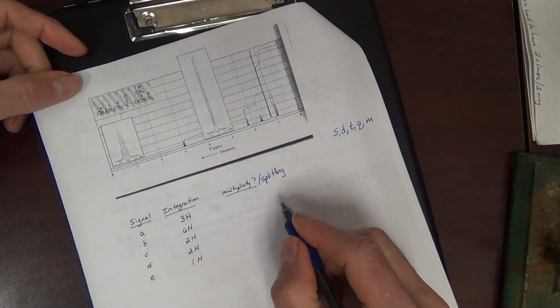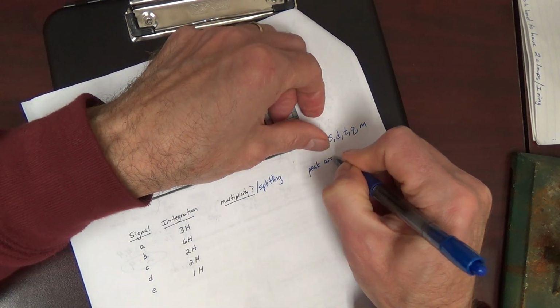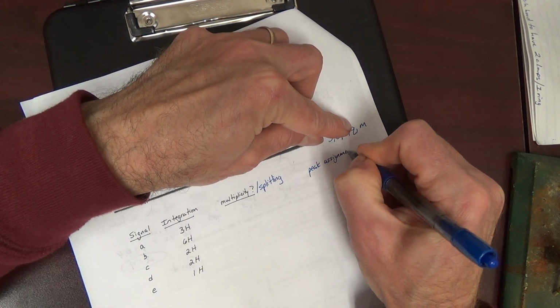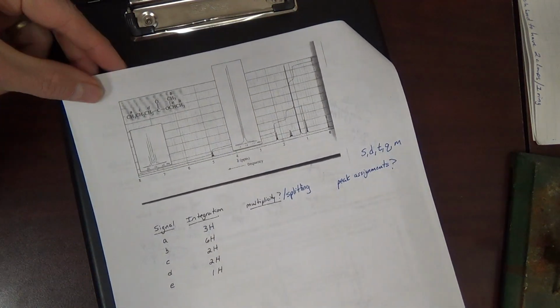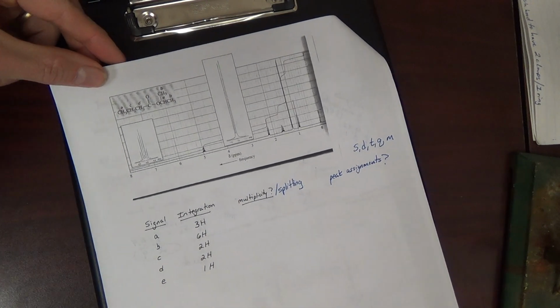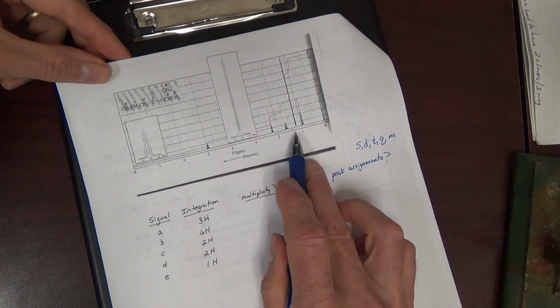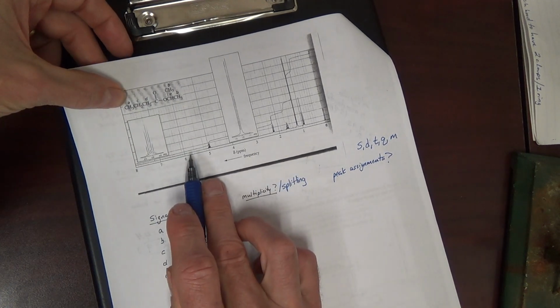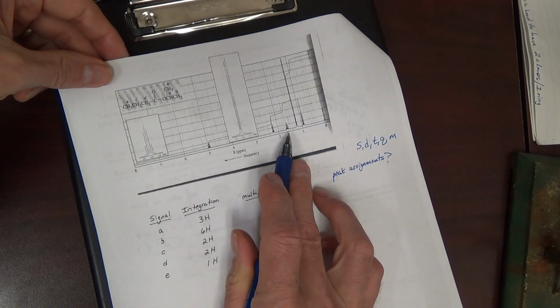But the other thing is peak assignments. That is, which signal in the NMR is for A? Which signal is for C or D or E or B? Okay, assign these.